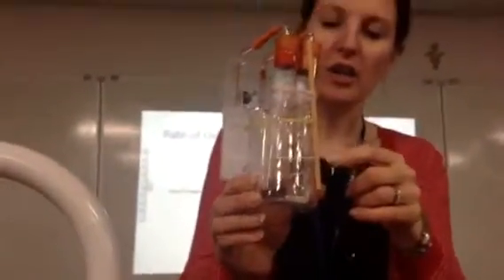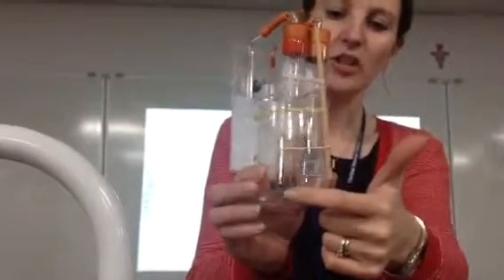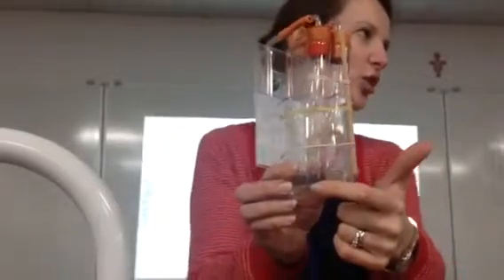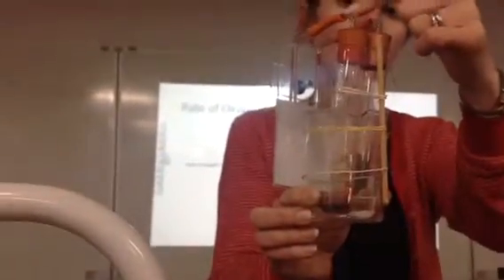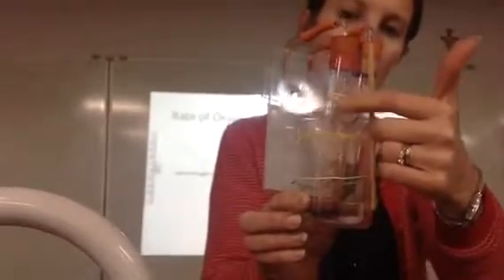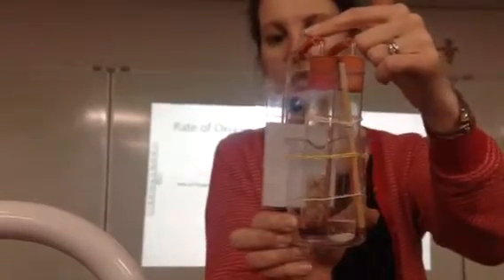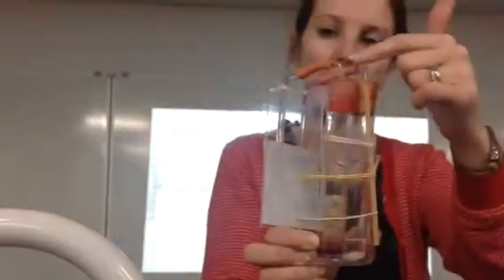So, what you've got is some peas, and then some fluid with your potassium hydroxide. What does the potassium hydroxide do? What do you think it might do? Pick up the CO2. So that absorbs the CO2. So basically the only volume that's coming into here is air, which contains oxygen and carbon dioxide and nitrogen, but the only volume that then goes back out is oxygen.